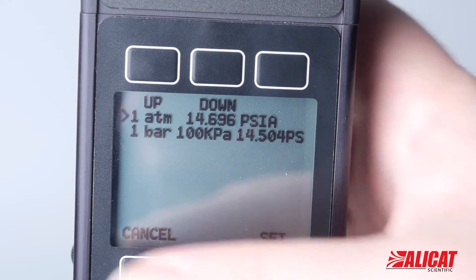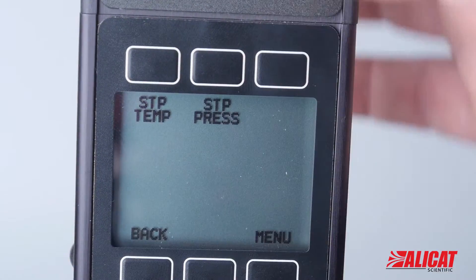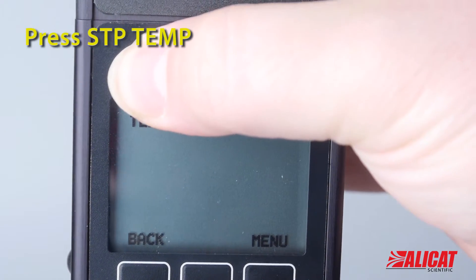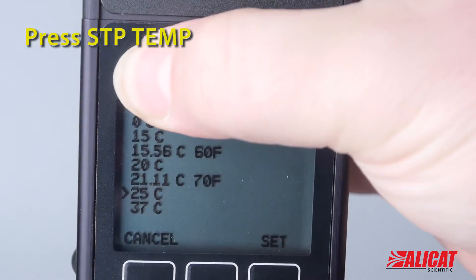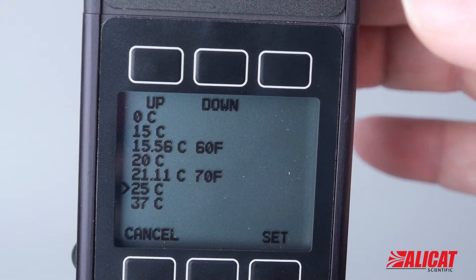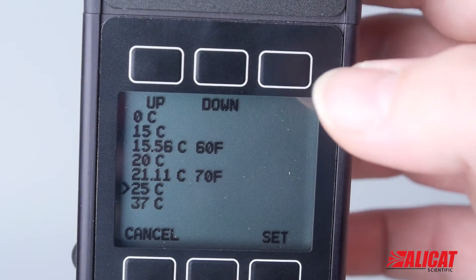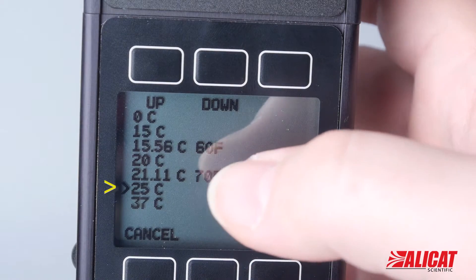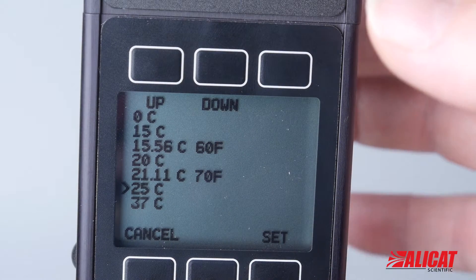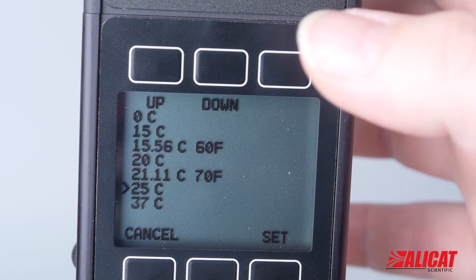Let's go back to the previous screen and look at STP temperature, which is where a lot of the variance in STPs happens. Here we have many more choices. Right now it's set to 25°C — the caret to the left of the column shows us that we're using 25°C and one atmosphere as our STP.